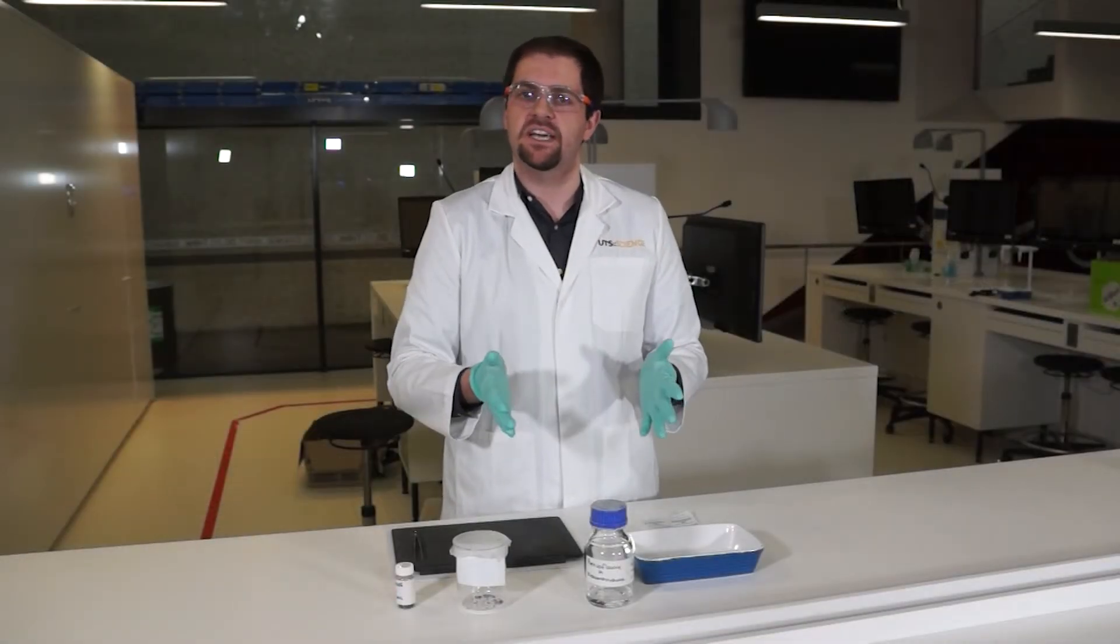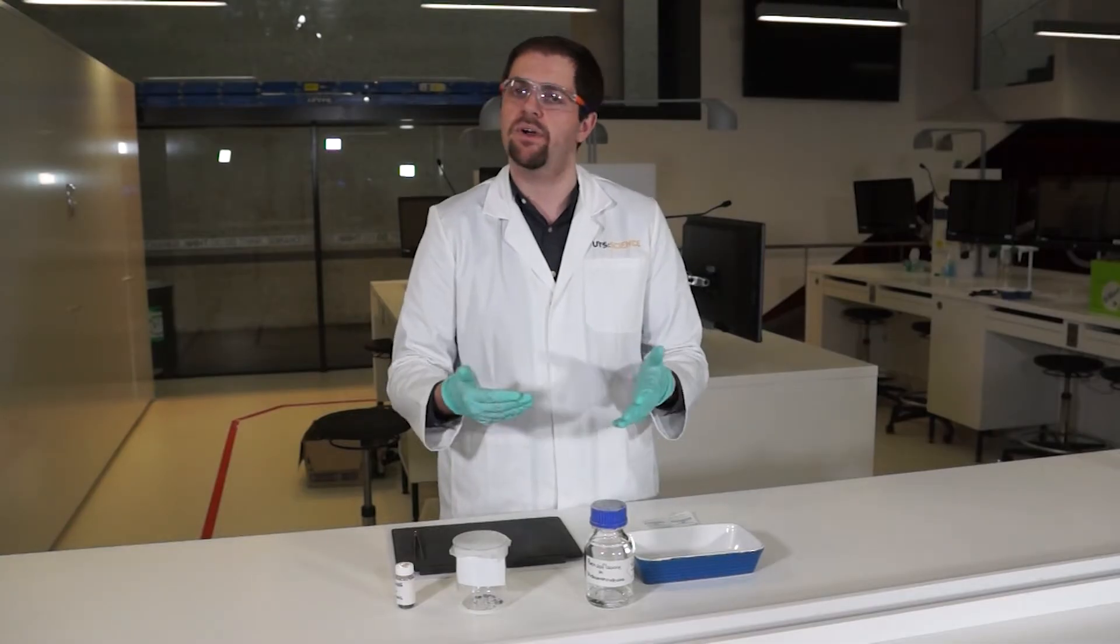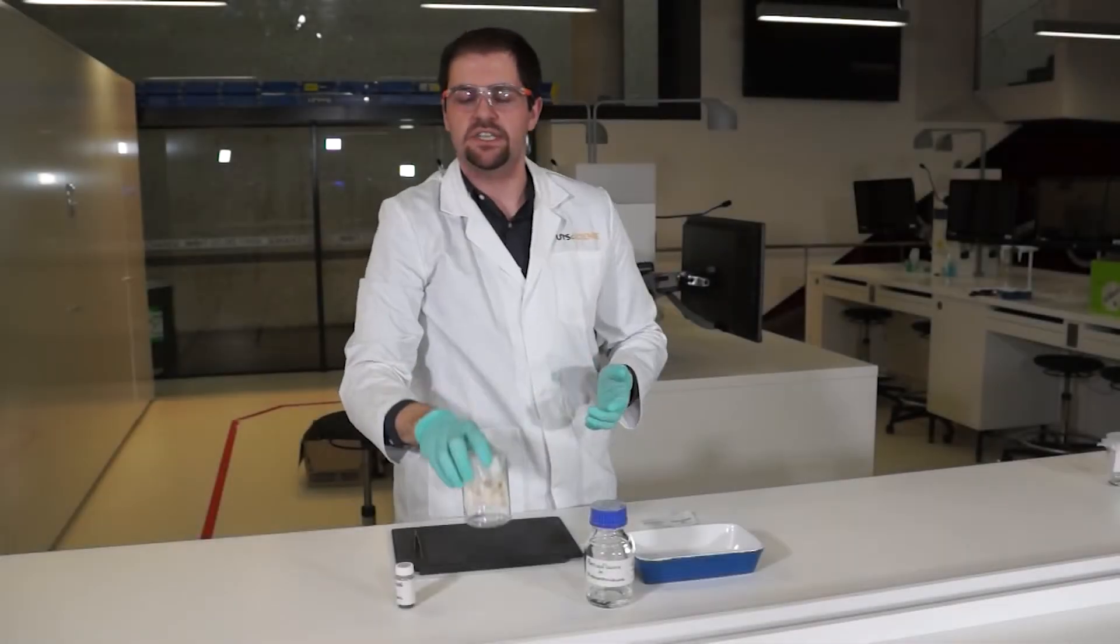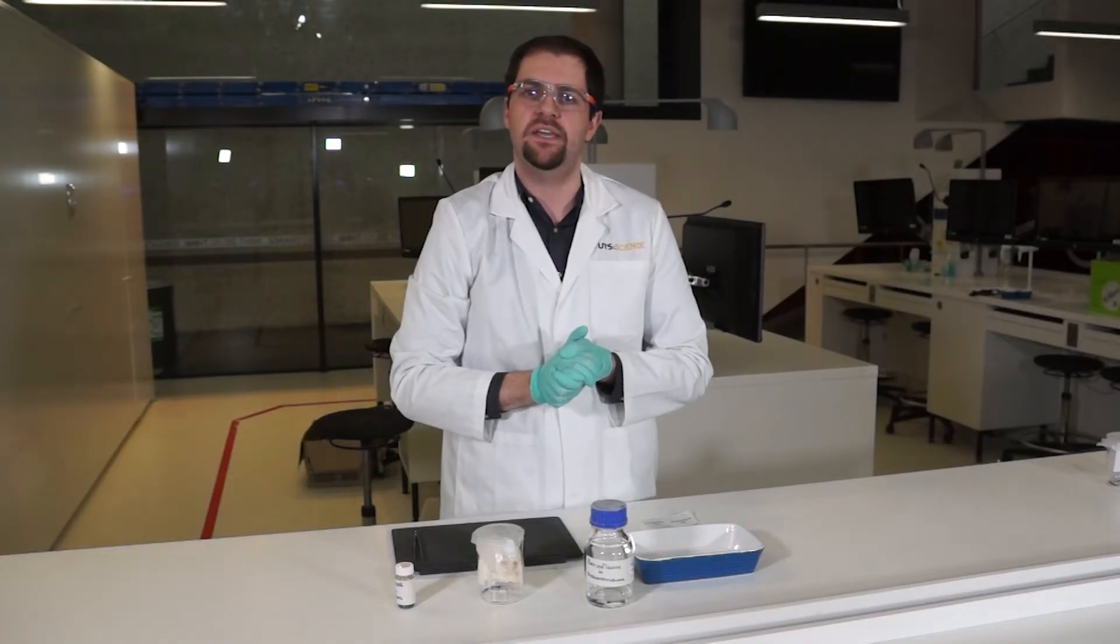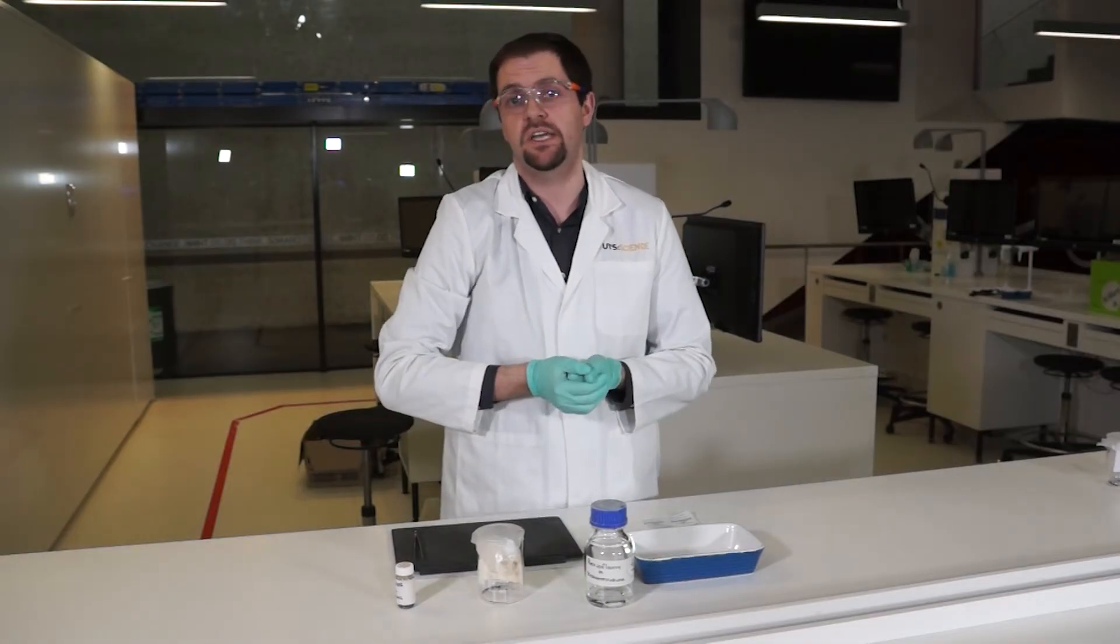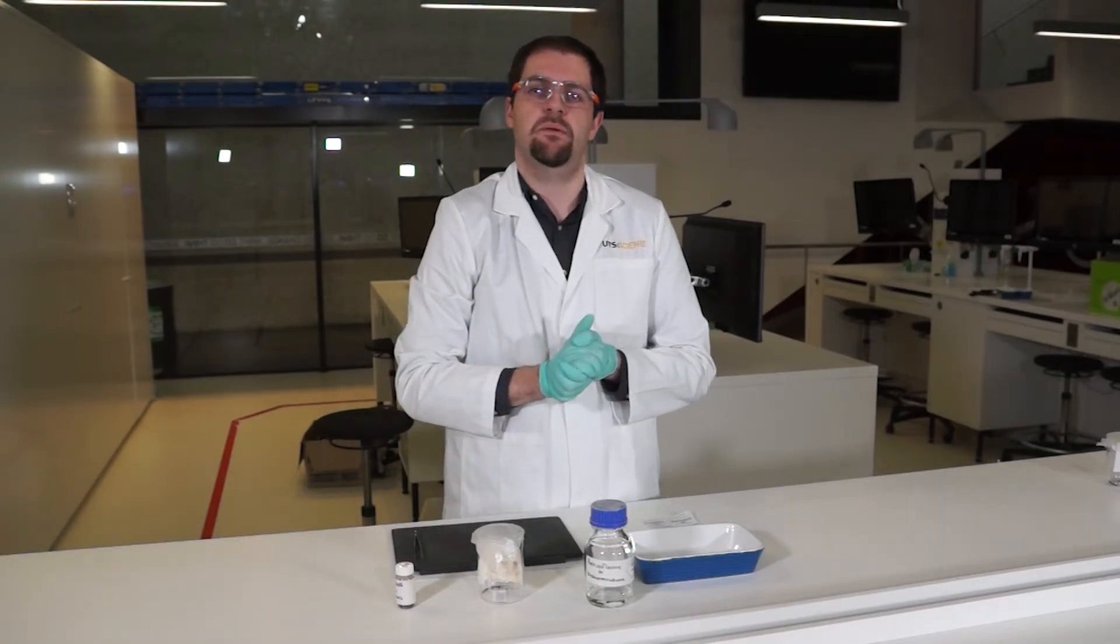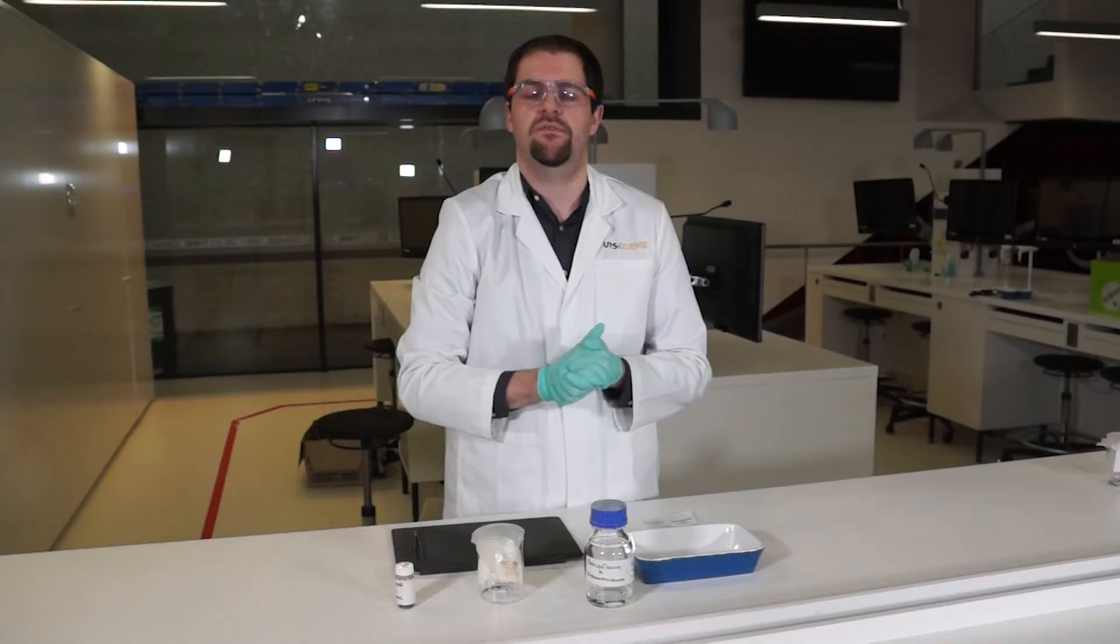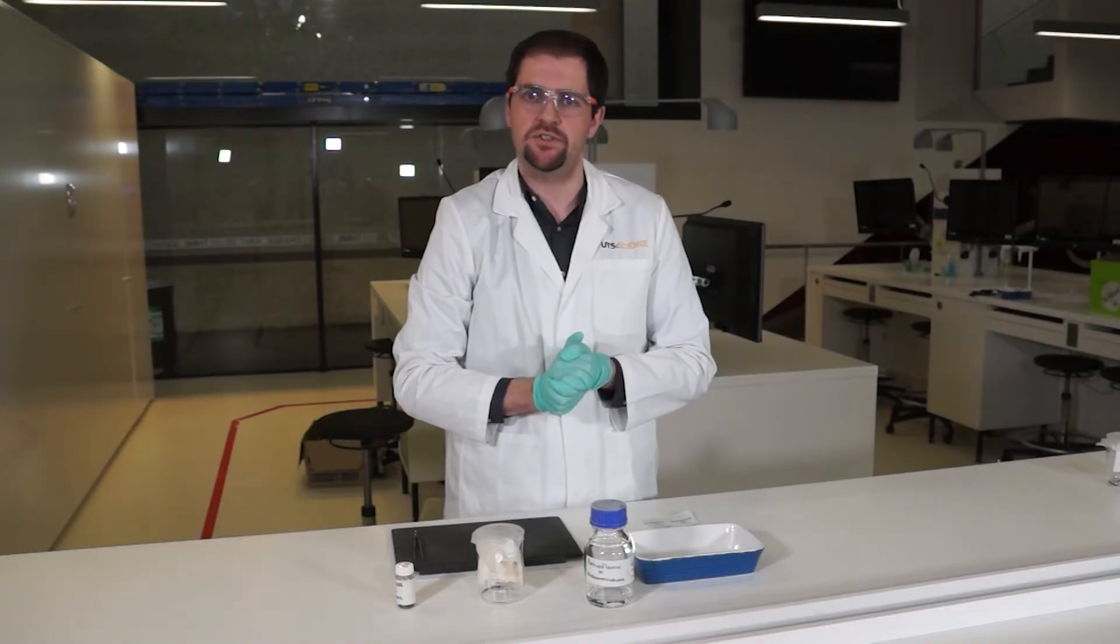The finger marks will then develop in about five to ten minutes and form a nice brown coloration on the paper. Here are some that we've developed earlier. Now if we were to take these out of the beaker, they're actually going to fade quite quickly. So if we wanted to fix these onto the piece of paper so we can photograph them for later, we apply what we call a fixing solution.